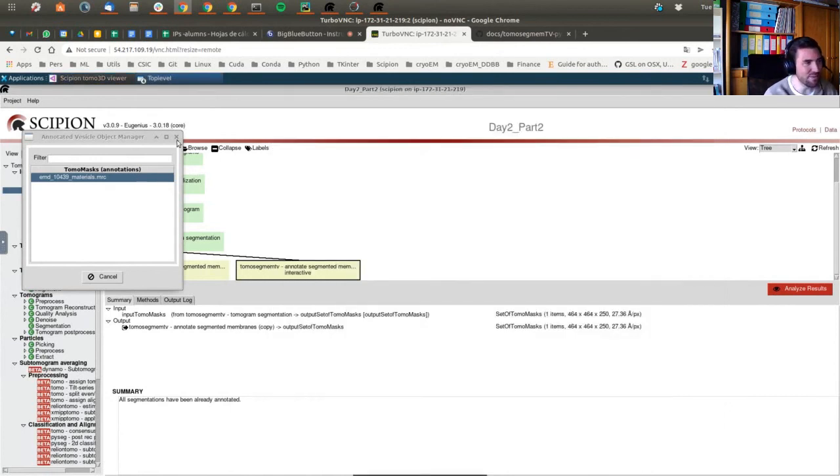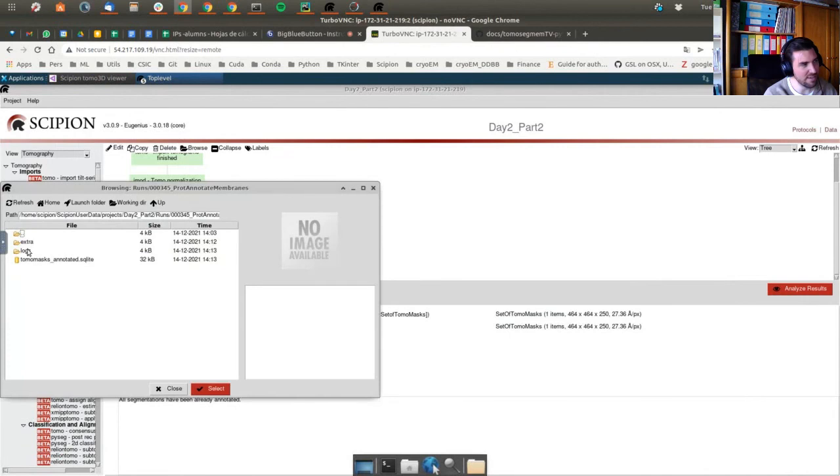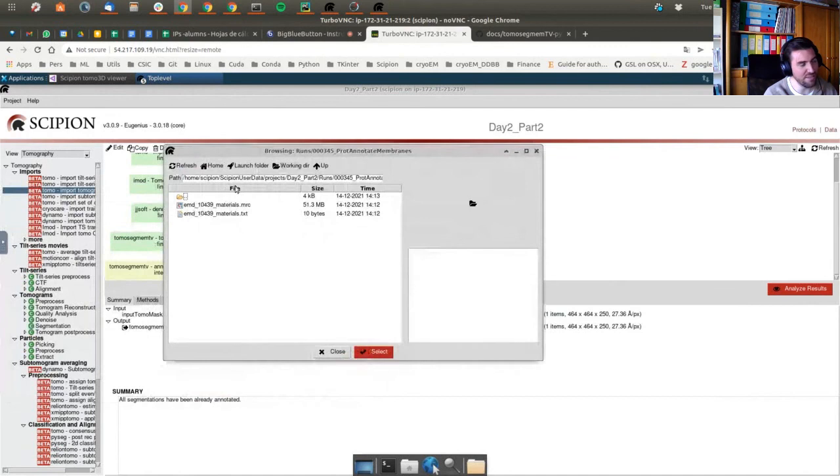let's make a small check-in. Click on browse. What's this? Click on browse, extra, and you should have this here. If you have this here, it means that everything is fine, but that window didn't refresh correctly, so you can cross your fingers and close it. Everything should be fine.